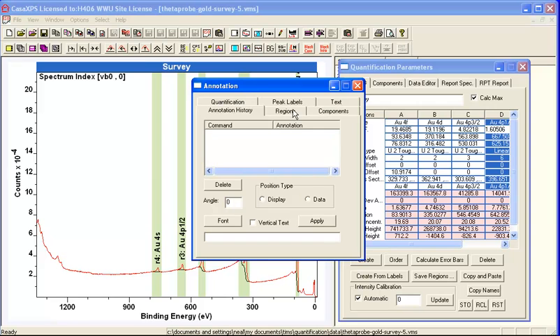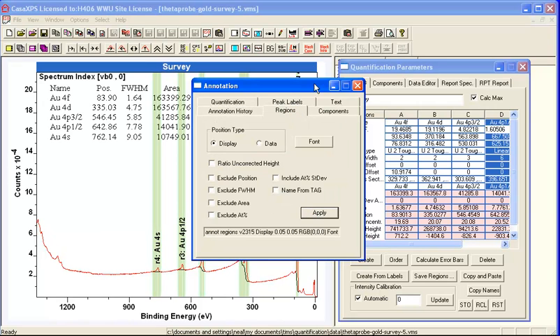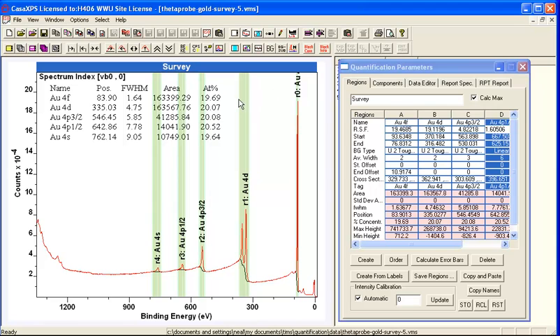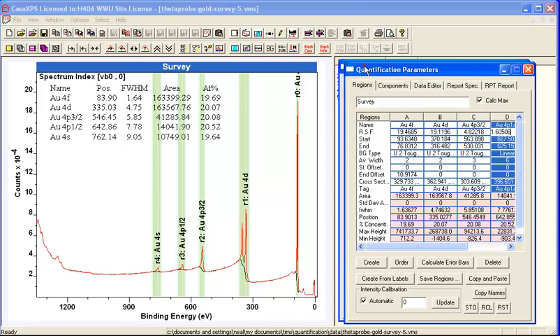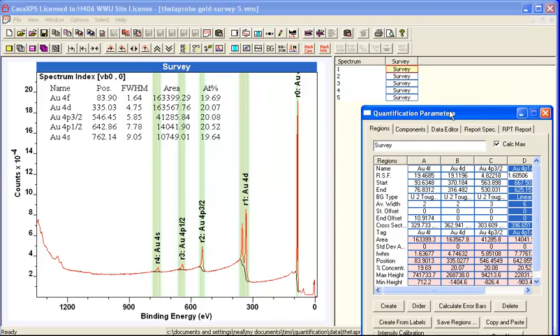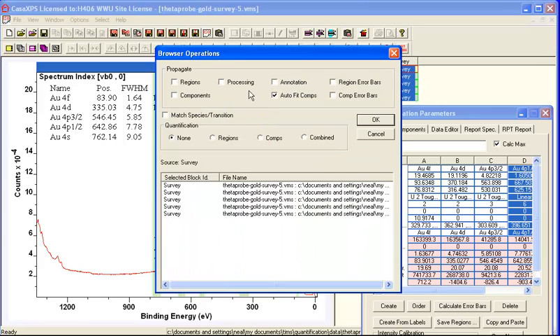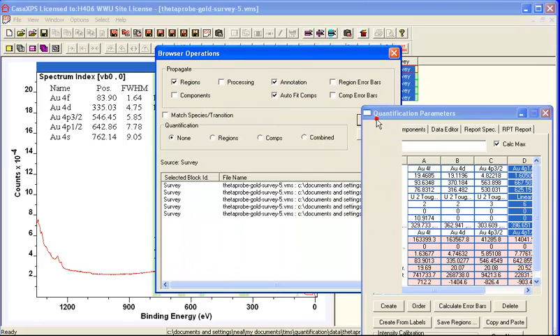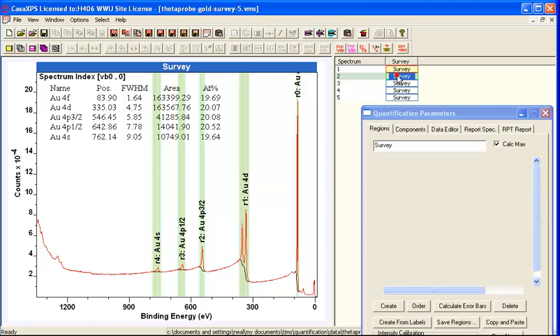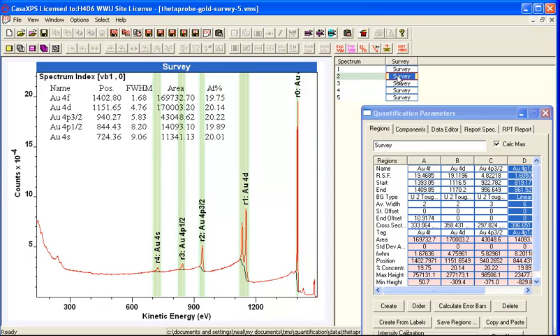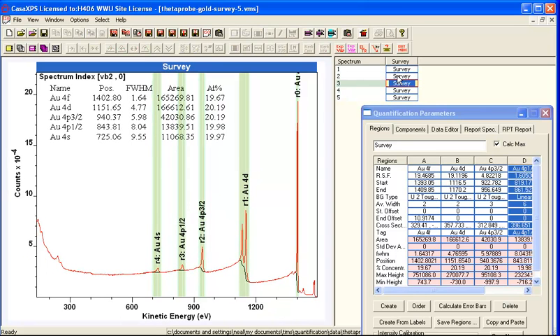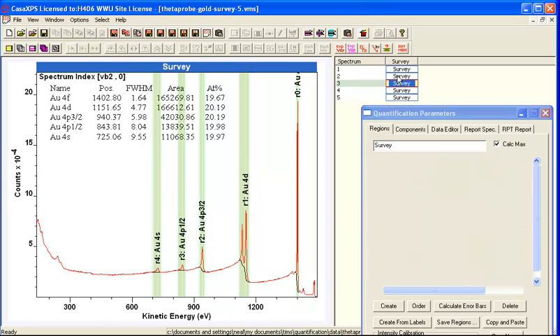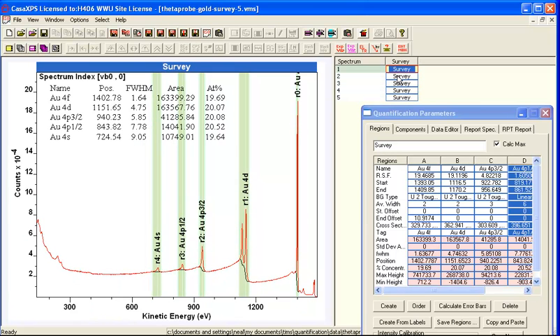And when this is performed, we end up with an atomic concentration calculation, in this case actually percent area. I'll just propagate this to the other blocks in this list. So we're looking at the same data, but this time quantified using the escape depth corrected RSFs rather than the raw Schofield and the first order approximation of energy raised to the minus 0.6.